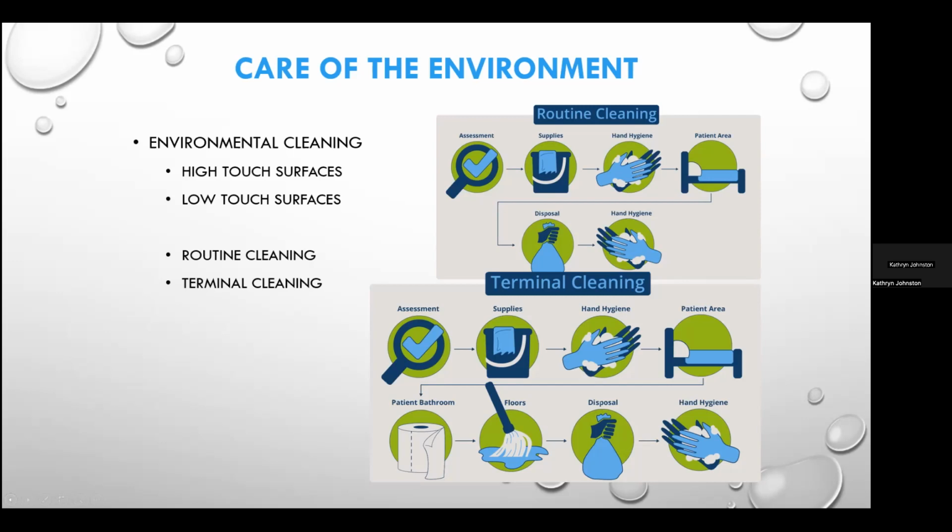But it's really important that they're properly trained, that they are familiar with the supplies that they're going to use, and that they understand the processes and the order in which these processes need to be applied in order to effectively clean the area, decrease microbial bioloads, and also to protect themselves from becoming self-inoculated and infected.